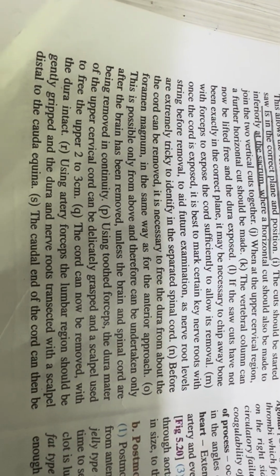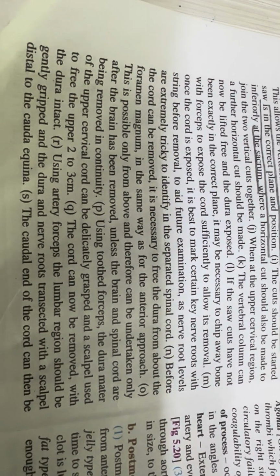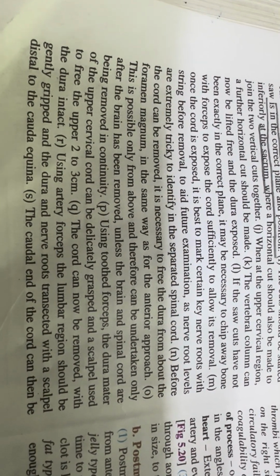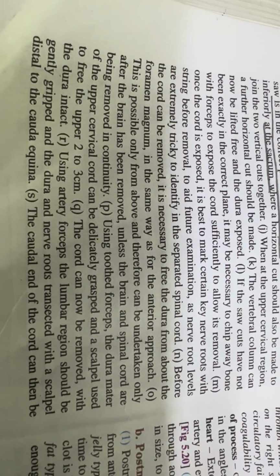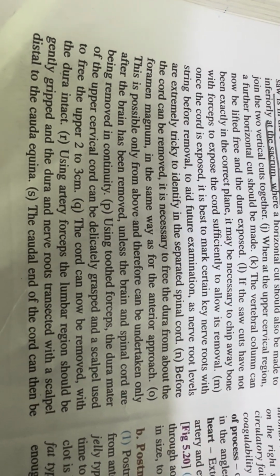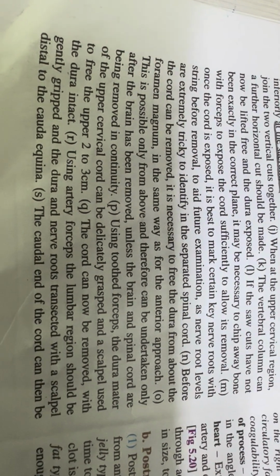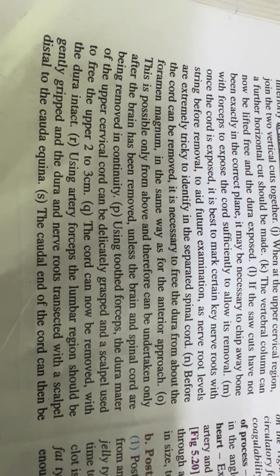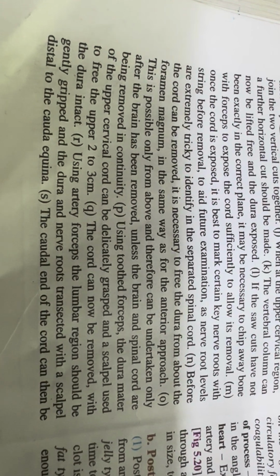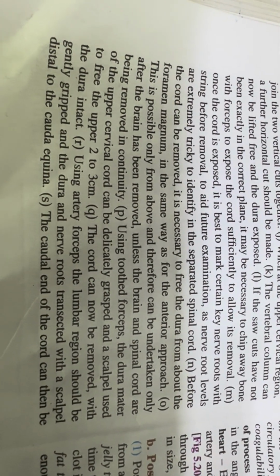If the saw cuts have not been exactly in the correct plane, it may be necessary to chip away bone with the forceps to expose the cord and sufficiently allow its removal. Once the cord is exposed, it is best to mark certain key nerve roots with a string before removal, to aid future examination, as nerve root levels are extremely tricky to identify in the separated spinal cord.